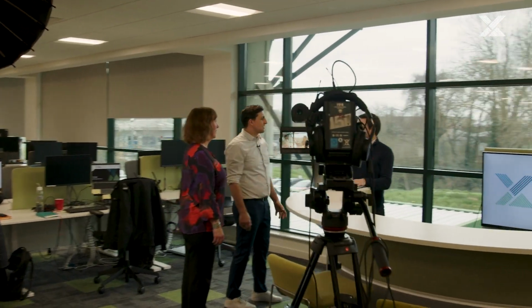Hi Greg, thanks for finding the time to speak to us today. Anytime. What has been the prime consideration while developing the software for the Zetasizer Sample Assistant? When developing an automation solution, we have to consider the critical components of setup, maintenance and error handling. How is this shown in the software interface?